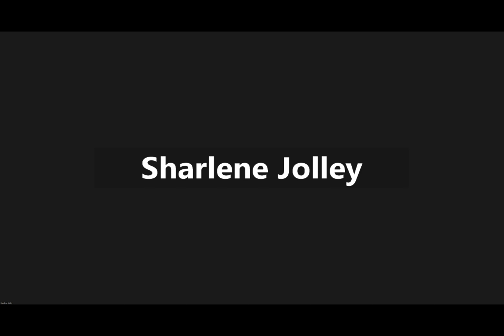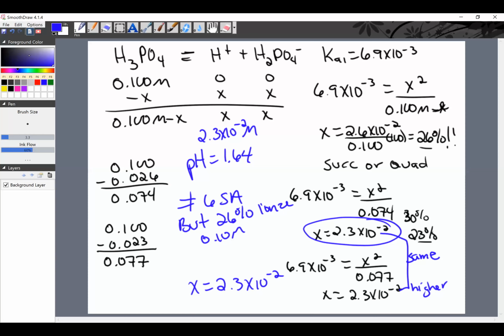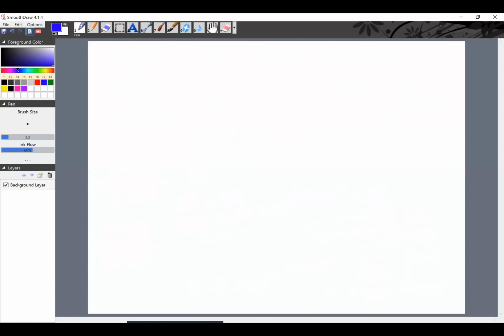Okay, now ammonia is a base, so this time I'm expecting a basic pH. And why am I having you do this particular one? Because it's the one that we make buffers with and everything, so you're going to be playing with it a lot in the next one.